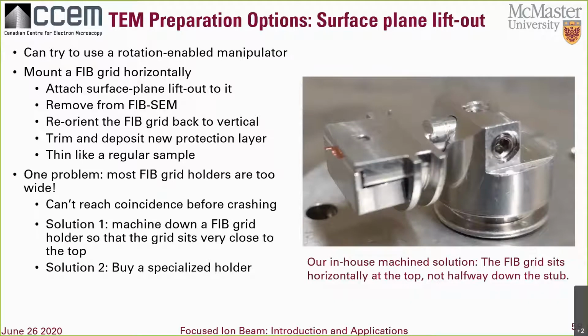If you can machine a grid holder stub to be nearly flat on one side, then you've solved the problem. This is one that I designed, and I had our mechanical guru technician, Andy, make the modifications, and it works very well. So I recommend something like that.